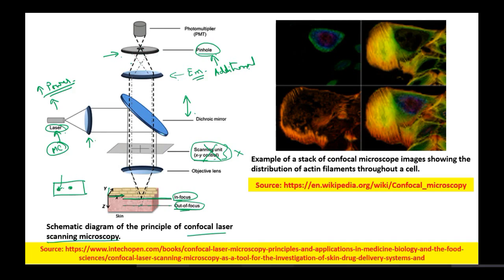Okay, so in this way, this confocal laser microscope is allowing us to get the information just from one single plane. So your depth of focus in this case would be narrow.